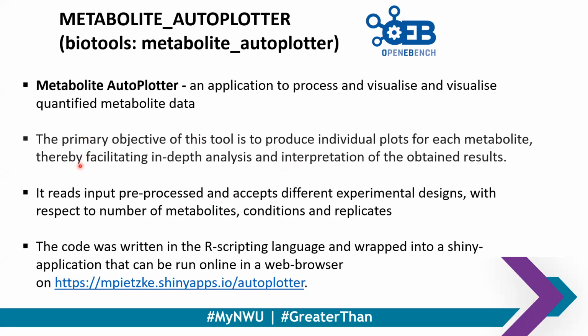The primary objective is to allow you to plot and interpret your results. Although with this, you must have done a pre-processing of the data, that is, knowing your compounds and having it in an Excel format, though it depends on the package with which your data is collected.